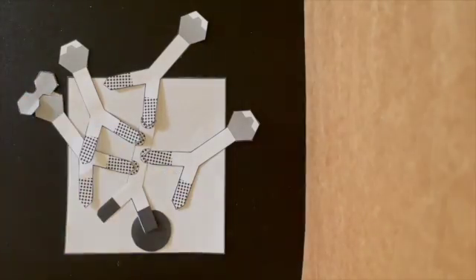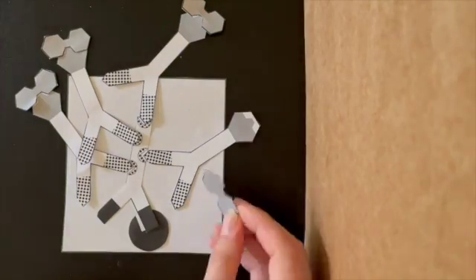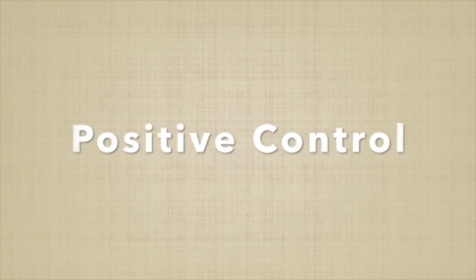In the final step, the substrate is added to the well and incubated for 5 minutes. During this period, the presence of SARS-CoV-2 stimulates the enzyme on the bound secondary antibodies to catalyze a reaction, causing the well to turn blue, which indicates a positive patient sample. As we have found in the antigen detection model, this model has the ability to identify the presence of the SARS-CoV-2 virus in a patient's sample.